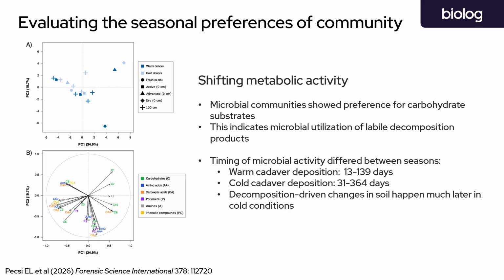Also, the timing of the microbial activity differs significantly between warm and cold seasonal conditions. Basically, decomposition occurs much later in the cold weather than in the warm. And it seems to be related to the community being better adapted to warmer weather, so that their microbial activity is higher during warm conditions.